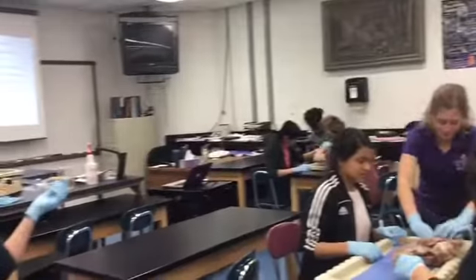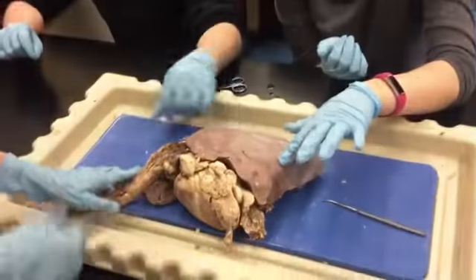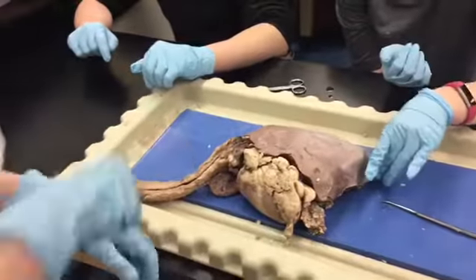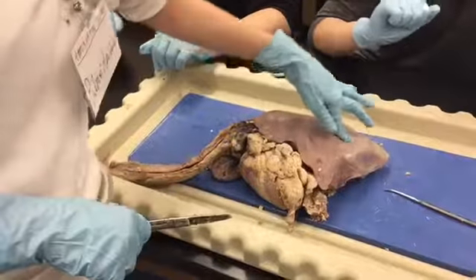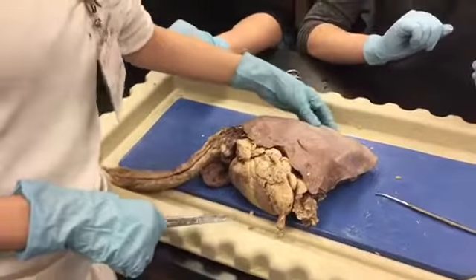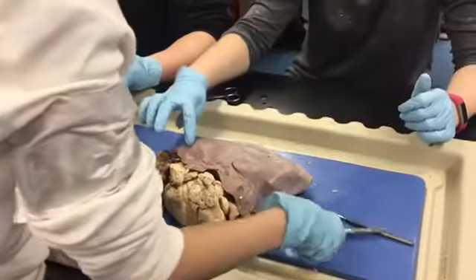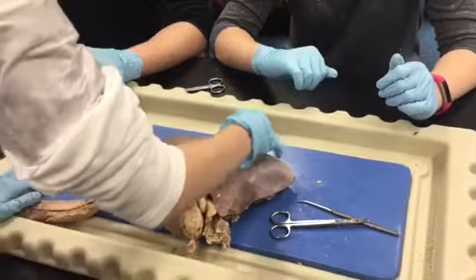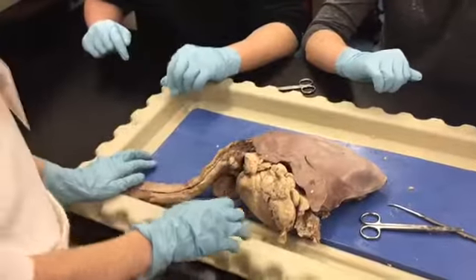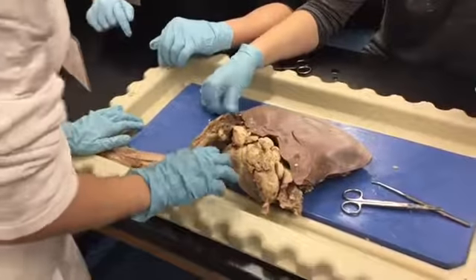Right now they're trying to feel what the lung feels like and it's crazy. Squishy. I don't know why this part's so squishy. This bottom part is super duper squishy. This part's not nearly as squishy. It's weird. So here it's separate.